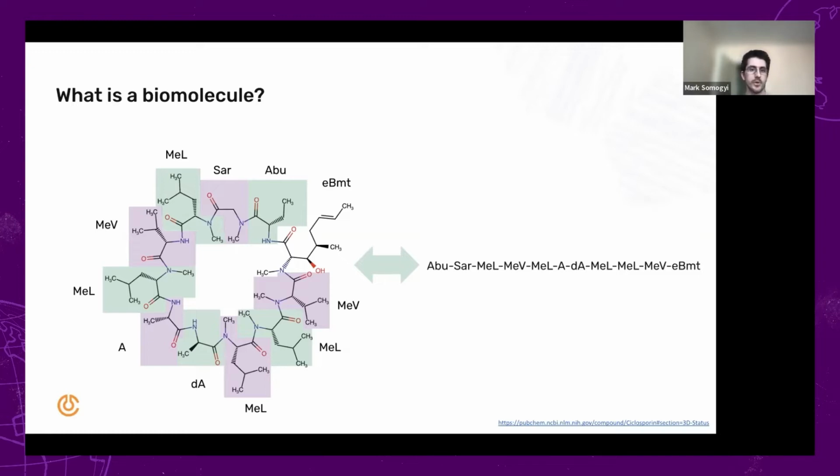To perform a thorough analysis on these structures, you need to have this information together somehow in one. Because when performing the analysis, first of all, you will do sequence comparisons, and later on you will drill down into the chemistry. And the sequence-based representation might not be verbose enough for those who are not using the given nomenclature. Maybe it's not trivial for them to use.